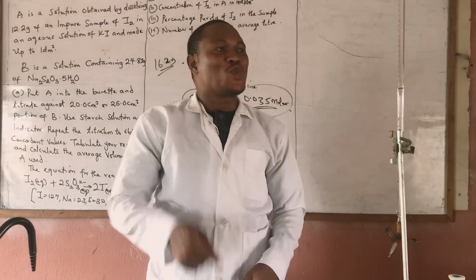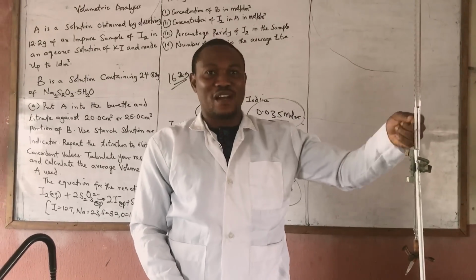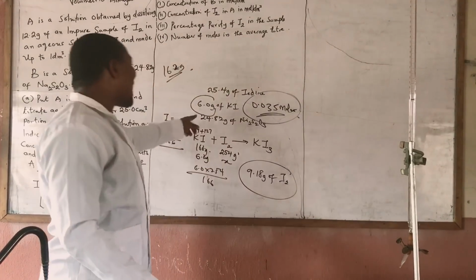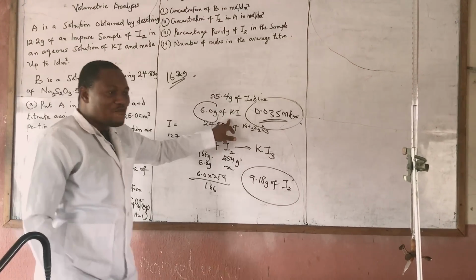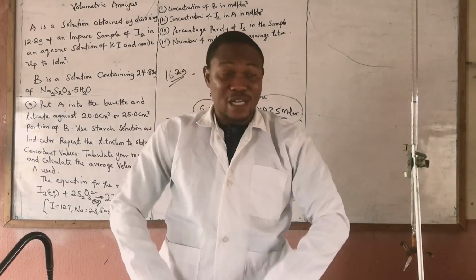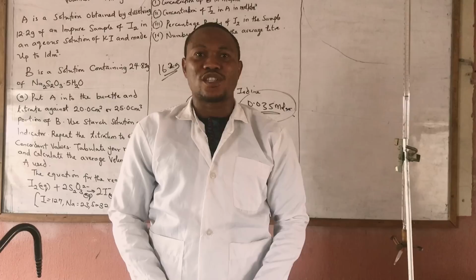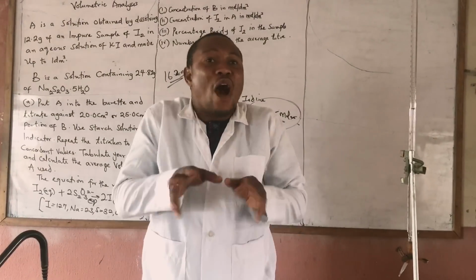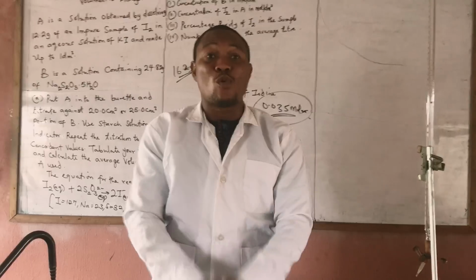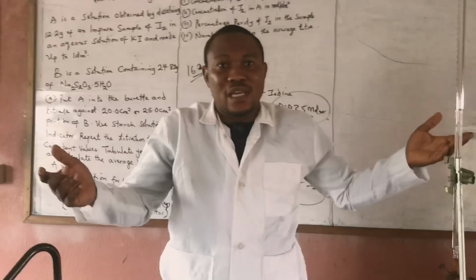But if you are going to have iodine in the burette, it means that you need to increase the concentration of your potassium iodide. If not, you might not have a reaction. I will demonstrate it; you're going to see. We are not saying this is the exact question. This is a guide for students of how the question is going to look. Read the question dutifully. Can I tell you iodine will be in the burette? We don't know. It might be.